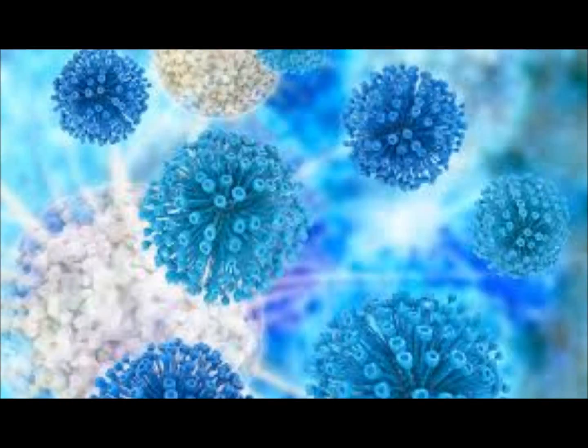These on your Gram stain would be gram-positive cocci. These would be gram-positive bacilli. And they look weird; you think of Oriental or Chinese letters, little V formations, or they'll have L formations. And you look at your Gram stain and think, oh my gosh, that looks like the diphtheroid.